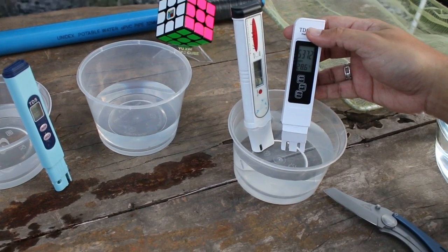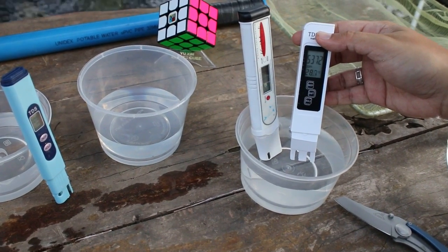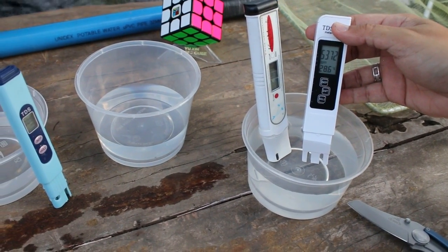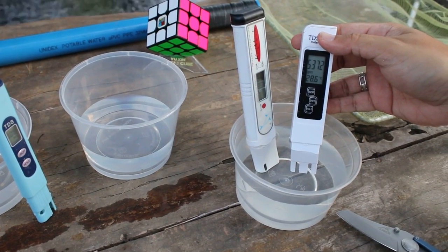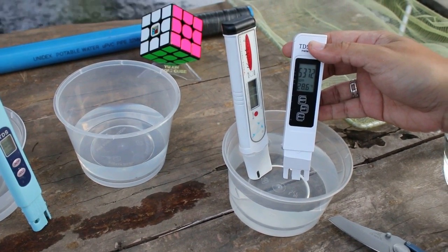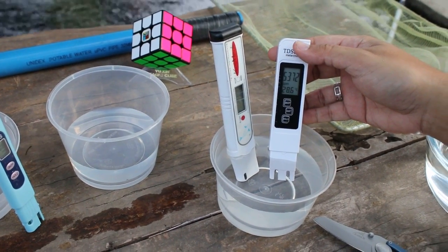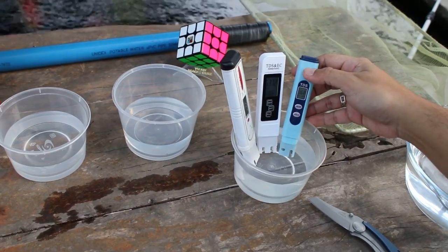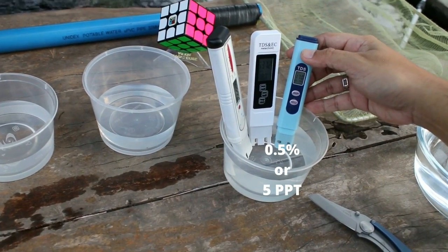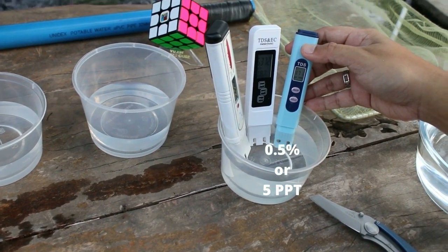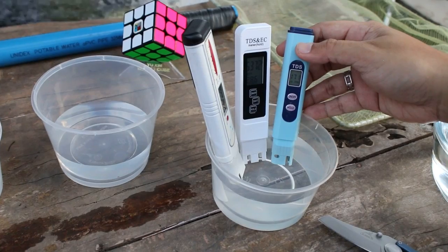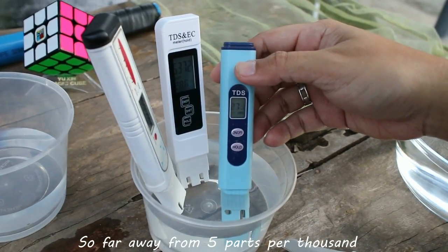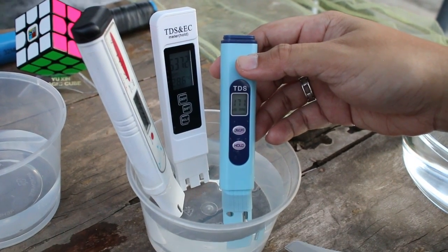5,372 parts per million, or in parts per thousand it's going to be 5.4 parts per thousand. That's quite far actually, the reading is quite far. The reading it's giving me now is 171 times 10 ppm. Can you see it? 171 times 10 ppm.